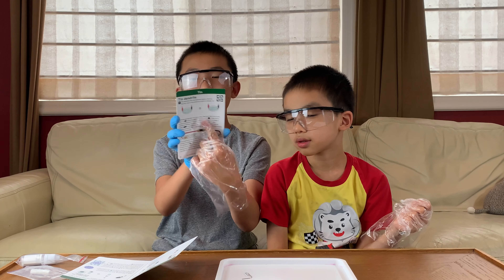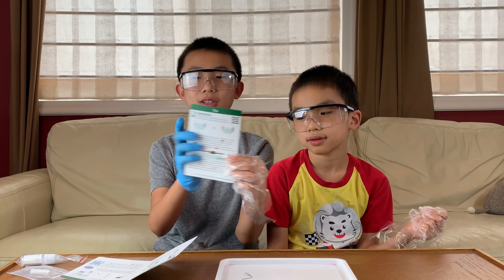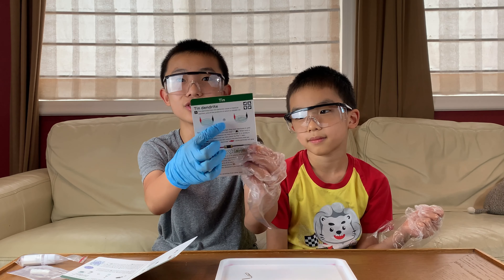We figured something out: the clock symbol means wait for a bit. For example, in the last experiment it means wait for the tree to grow, and in this one we have to wait for the hedgehog to grow. Step one we are already familiar with. Step two: we put zinc into a clear plastic tube with the solution.